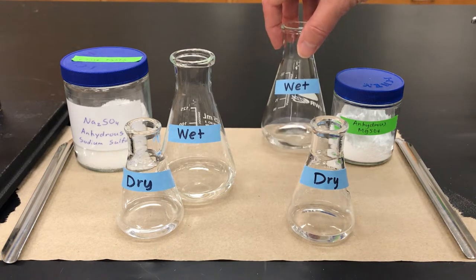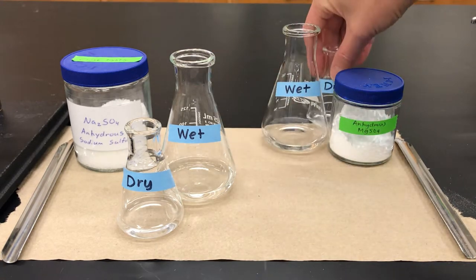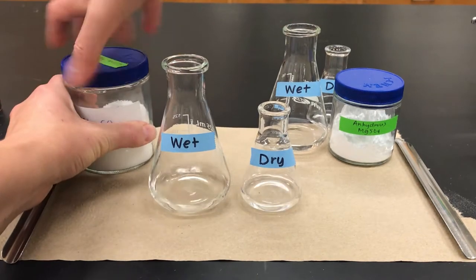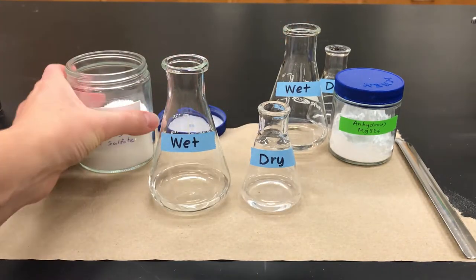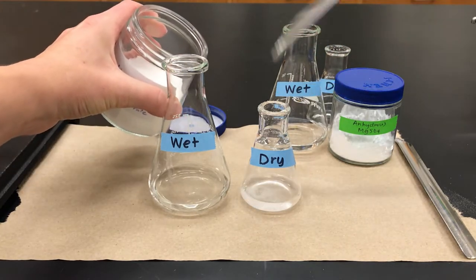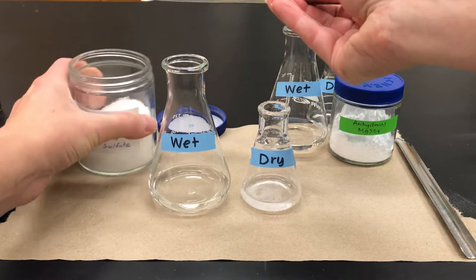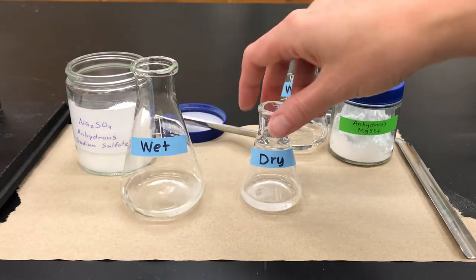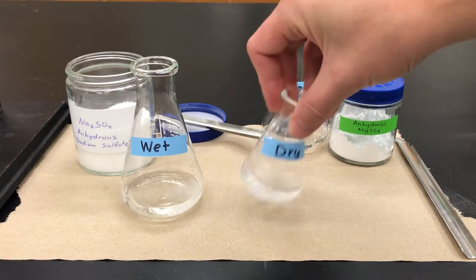Let's start with the sodium sulfate. You want to use a metal spatula and just take a small portion about the size of a pea and add that to each of the flasks, then swirl it around to expose the liquid to the drying agent.